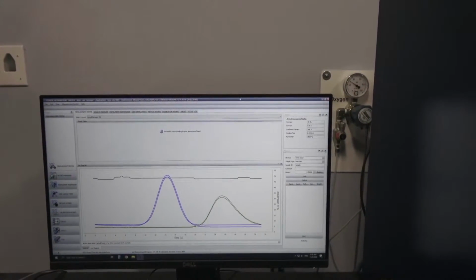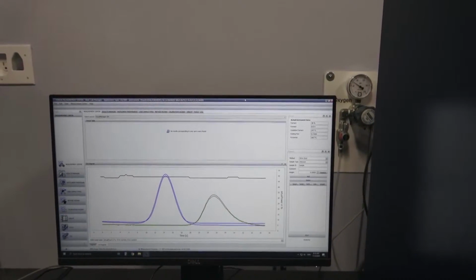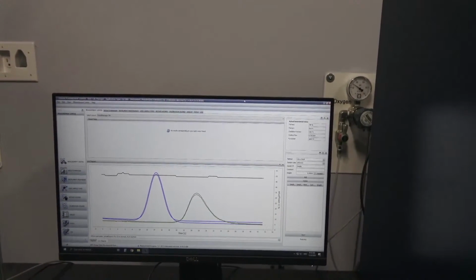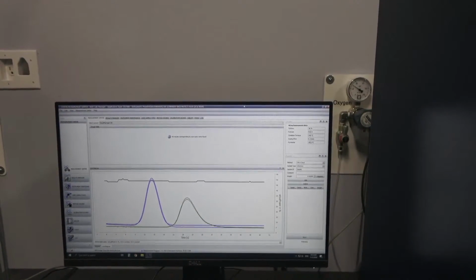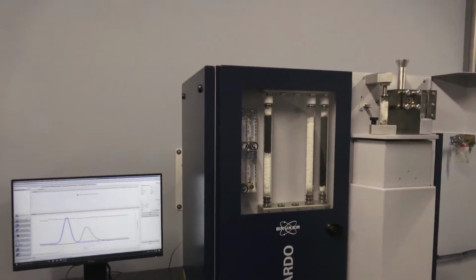And sort of like we saw in the video about combustion gas, we create a calibration curve for the peak areas here, and that's how it tells us how much. Yes, exactly. So you use some certified reference materials and you calibrate your method. First, you need to set up your method with all the parameters, and then you have to calibrate it. Once it's ready, just like here, you just drop your sample in there and you're good to go.